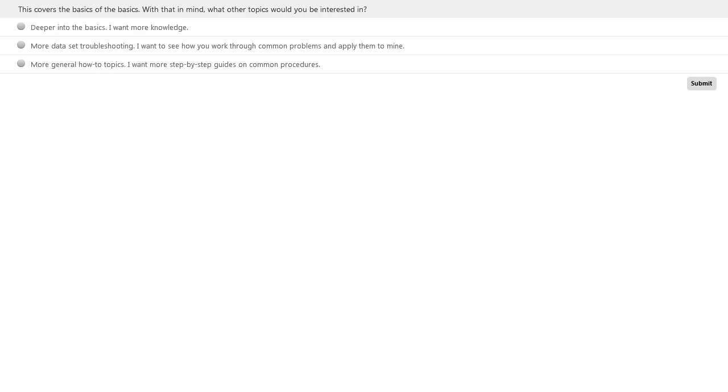Of course, there's more data set troubleshooting. I want to see how you work through common problems and apply them to mine. So I got this data set from a customer, and I was able to step by step go through this and say, hey, here's how I would do things with your data. Of course, that means I'll need your data to do so.